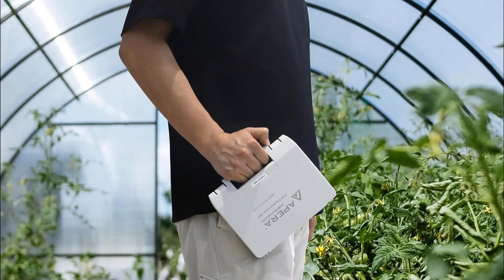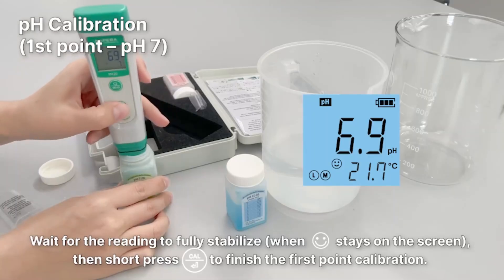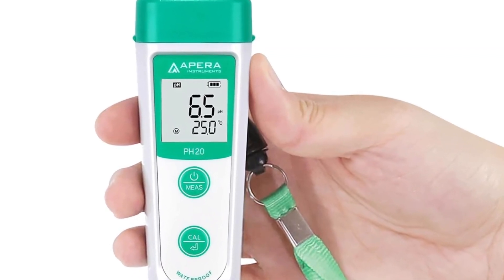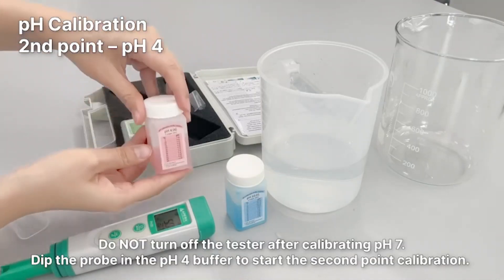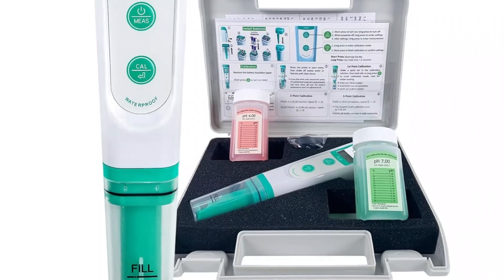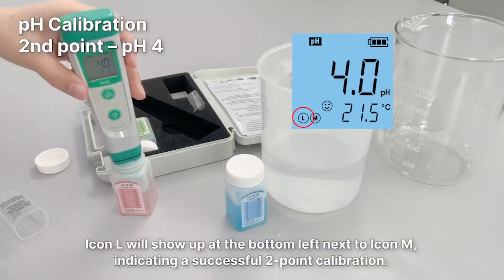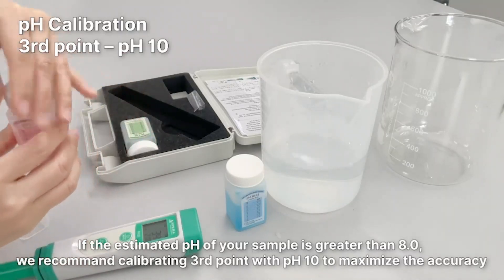Its fully waterproof design with an IP67 rating is another great differentiator — it is dust resistant and can be submerged in water up to one meter for 30 minutes. The backlit LCD screen is clear and easy to read even in low light conditions; the large numbers and backlighting make readings accessible and comfortable at any time of day. The kit comes complete with calibration solutions at pH 7.0 and pH 4.0, a storage solution for the electrode, and batteries — meaning it is ready to use right out of the box with no additional purchases needed.